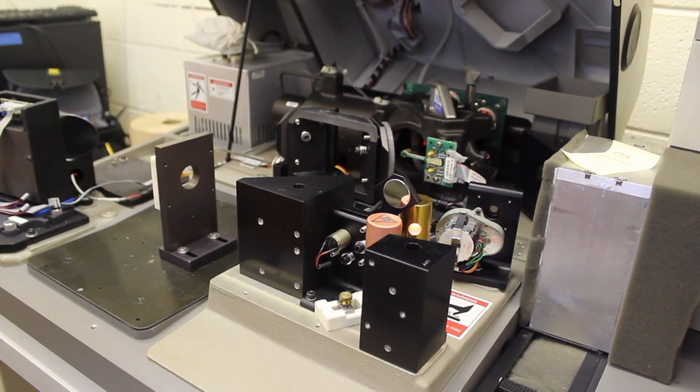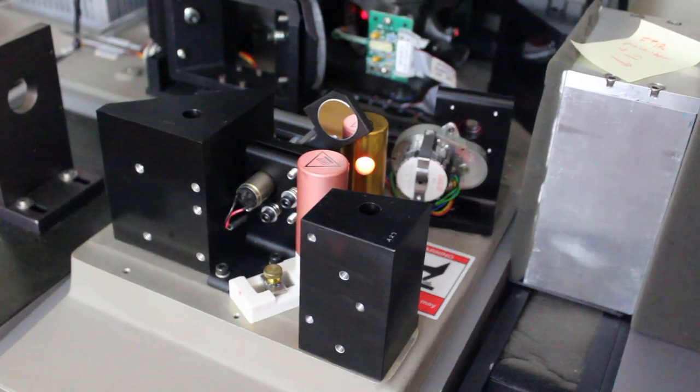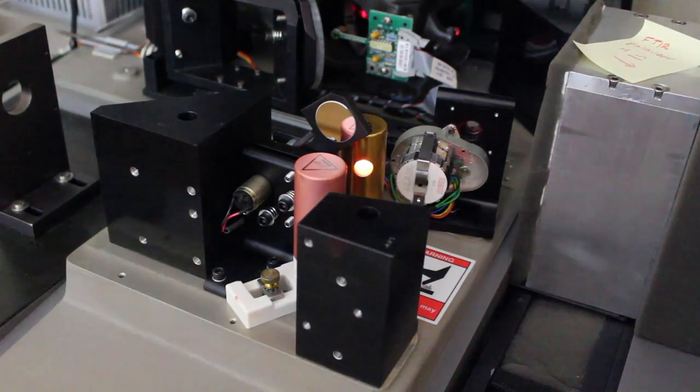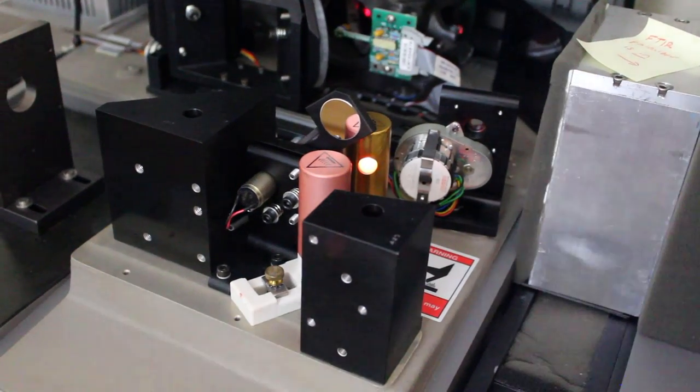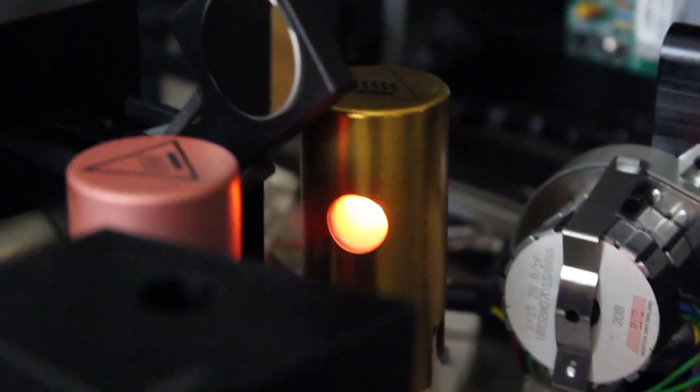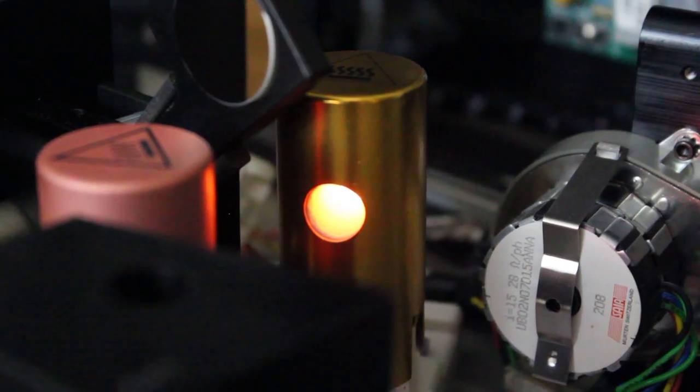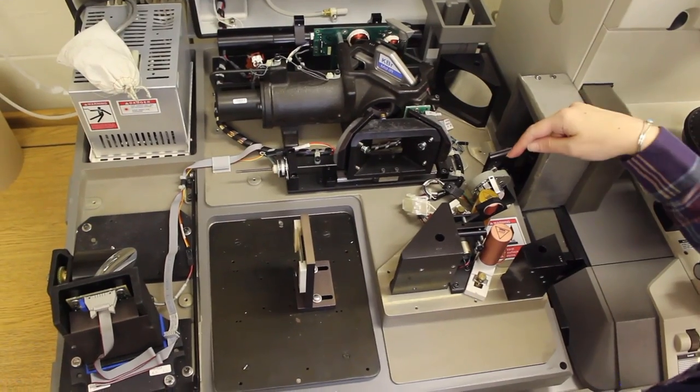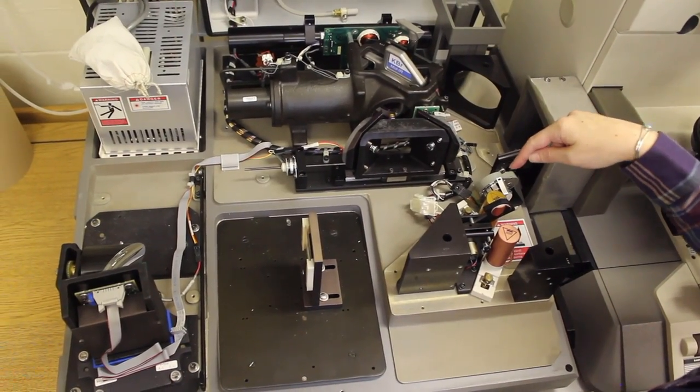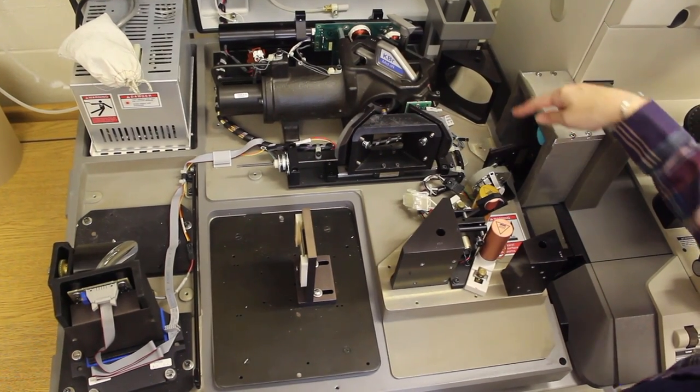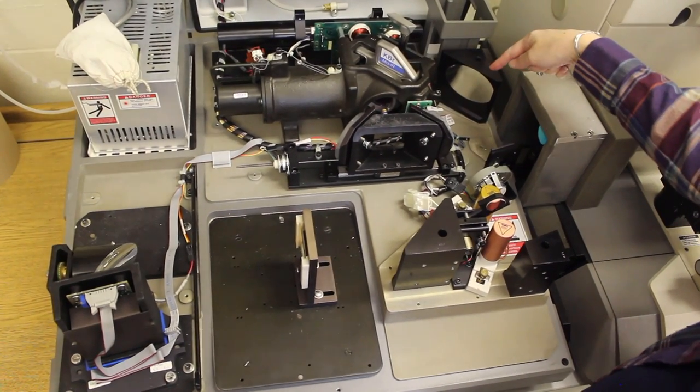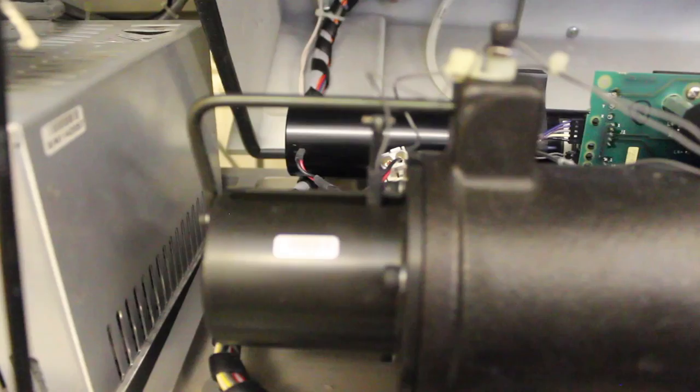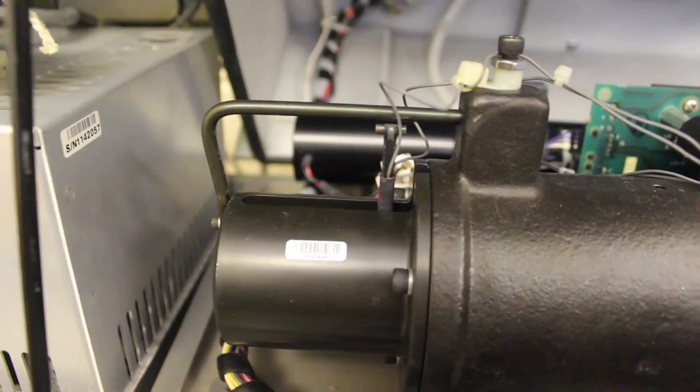This is the inside of an infrared spectrometer. This is the infrared light source which generates a spectrum of infrared light. The light then bounces off a mirror, hits another mirror, and goes into the interferometer.